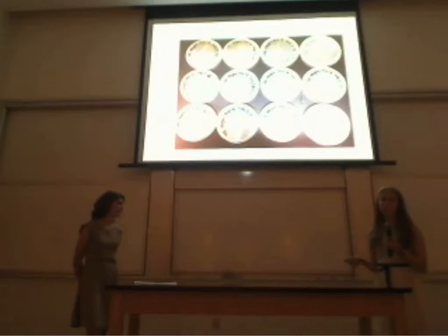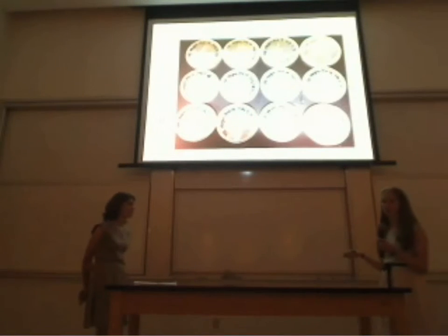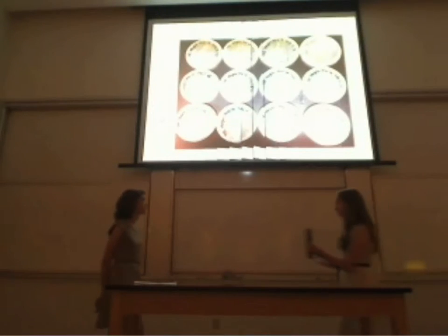And finally, these are 4 plates of the highest concentration for each type of E. coli. As you can see, these plates, the methylated and unmethylated groups, grew very well, and the bacteria with no plasmid did not grow at all.